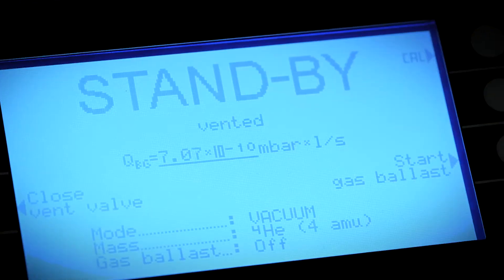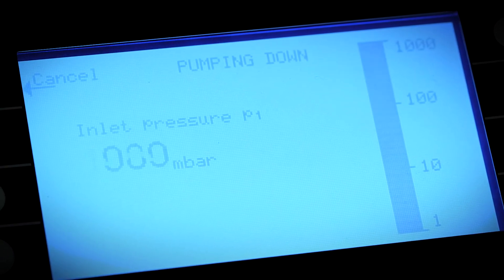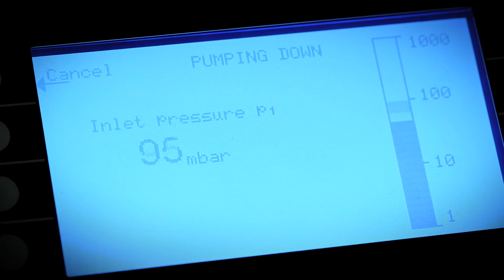Once connected, press the start button and the test port will pump down. Once the test port has reached 15 millibar or 11 Torr, the unit automatically switches to test mode. You can see that the indicated leak rate drops quickly.